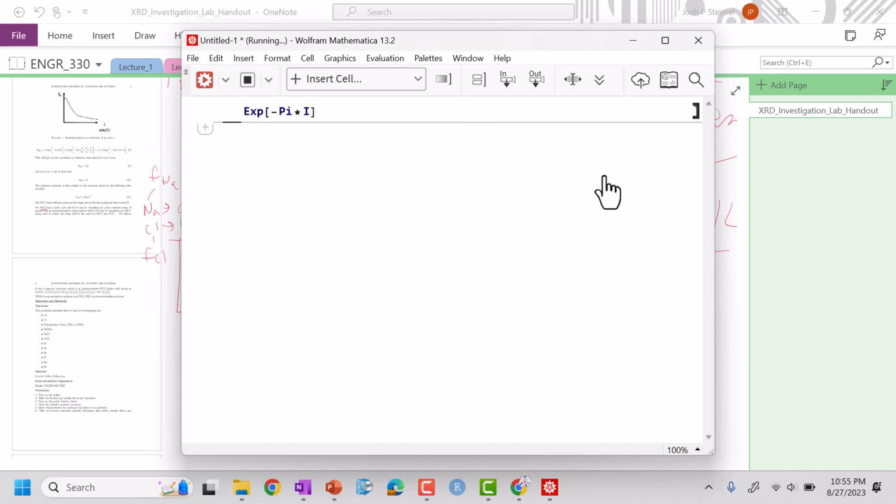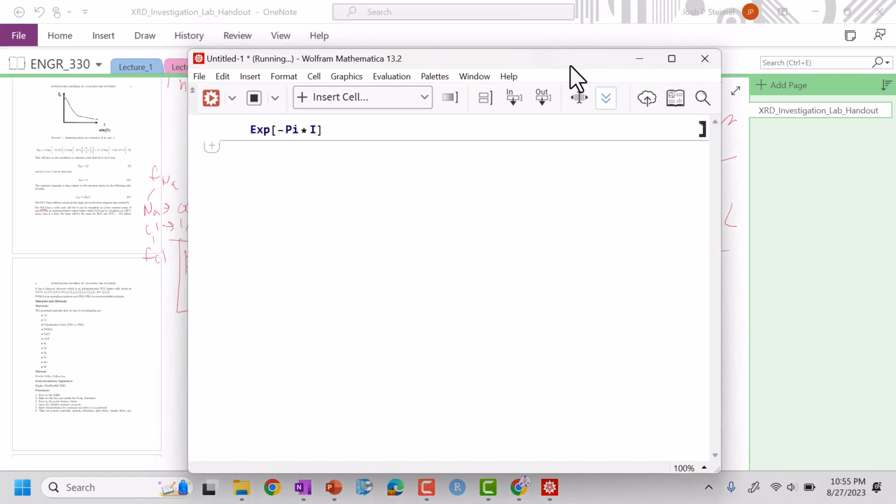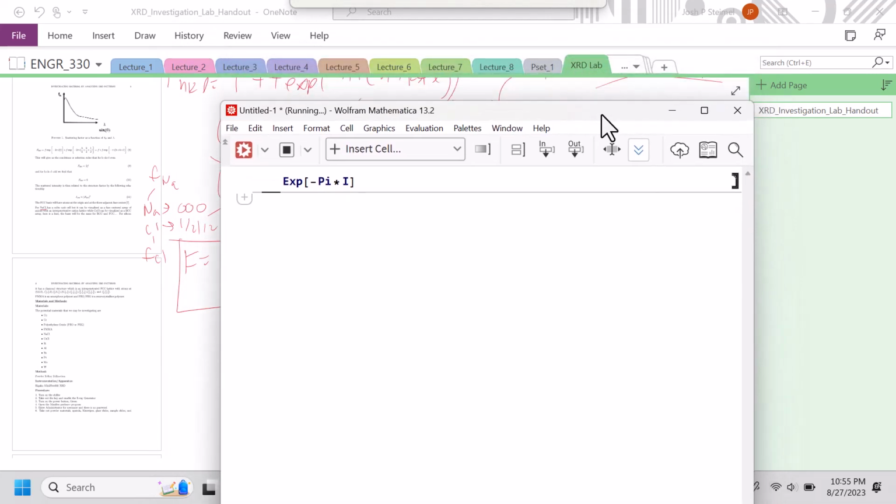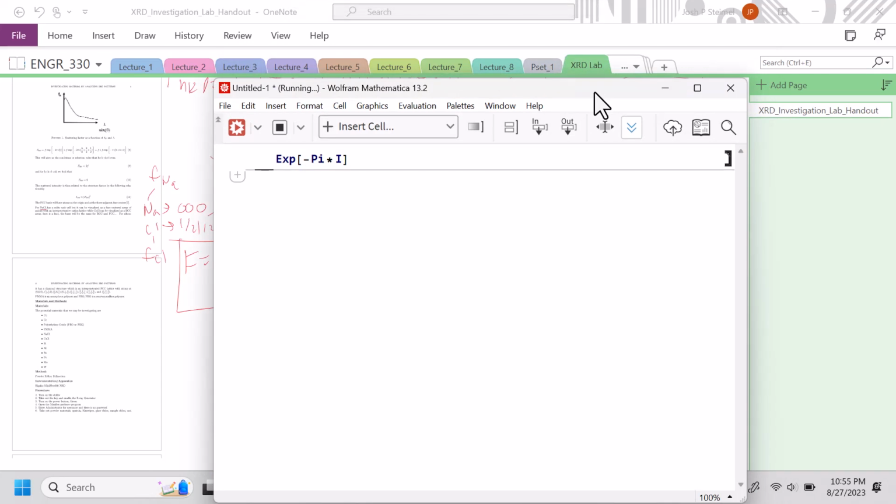Again, you've got to wake up Mathematica. I should not hum that. Public domain. I don't want to get the audio flagged. But hopefully we remember from the next time. We have to wake this up anyways, because next we're going to get into our data analysis section. But we're going to see something actually quite interesting here.